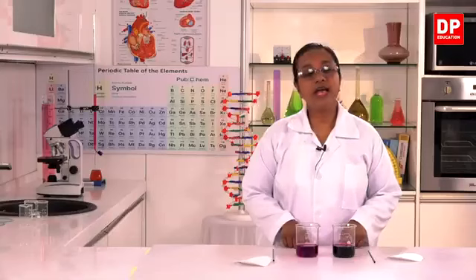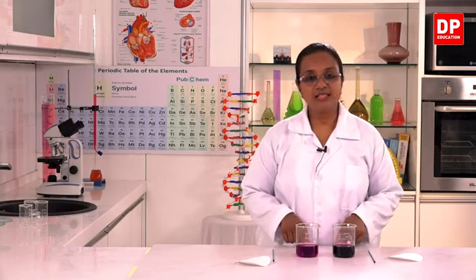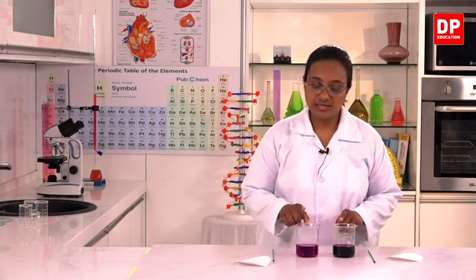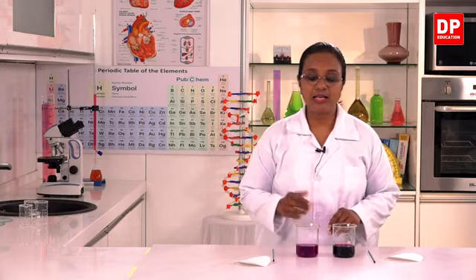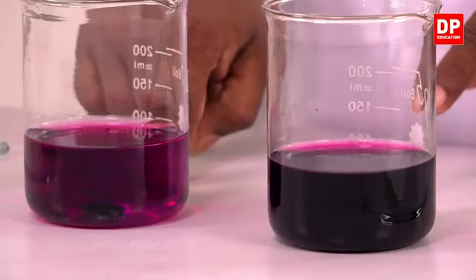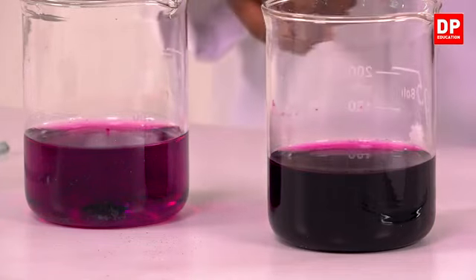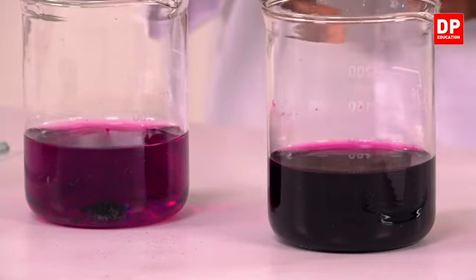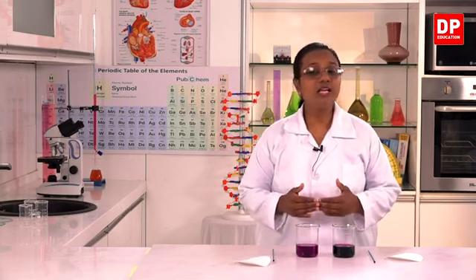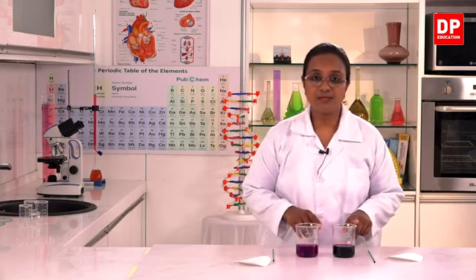Although the solvent and the solute are the same and both solutions are at the same temperature, because I took less amount of solute, that is less amount of potassium permanganate, the intensity of the color of solution is less here. And when we take more solute, the intensity of the color is more. What is the reason? The reason is the amount of solute in a unit volume of solvent is less in this and more in this.